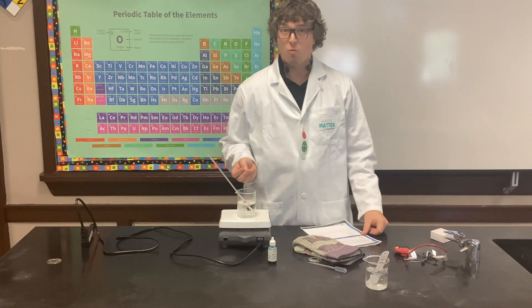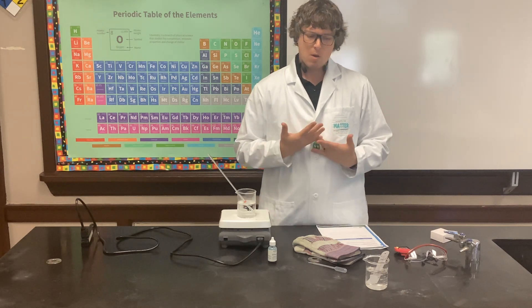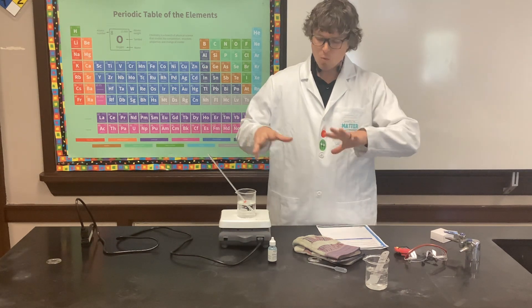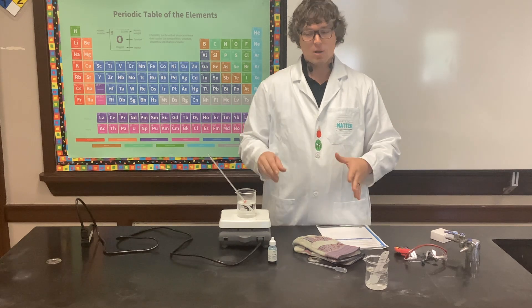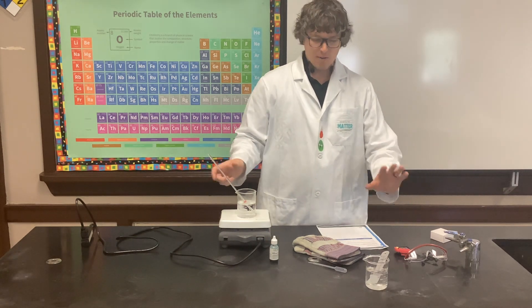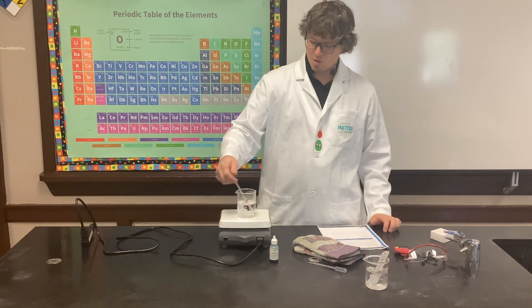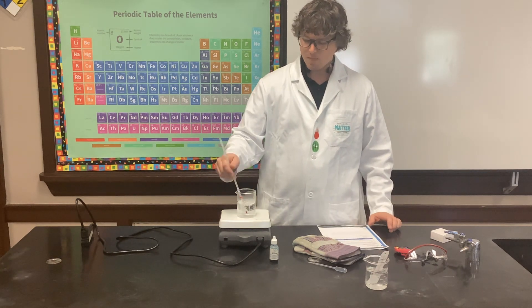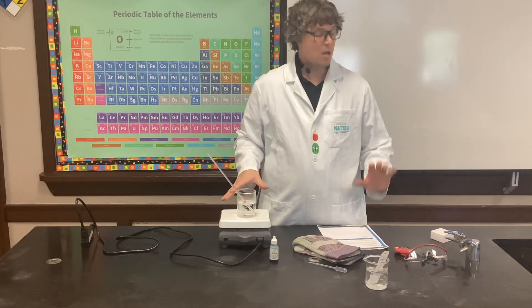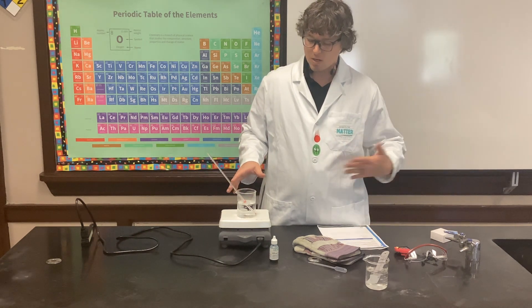This activity is about how the temperature of water affects the rate that molecules are moving. While you can't see the actual molecules' movement, you can visualize it using food coloring and some water. I have two beakers of water — one at room temperature, the other I've been heating on a hot plate. You don't necessarily have to have a hot plate; this school just doesn't have running hot water.